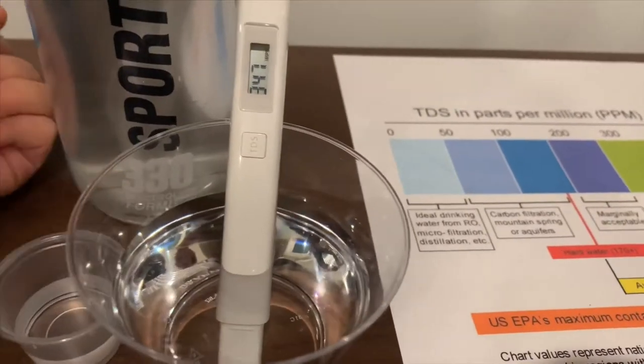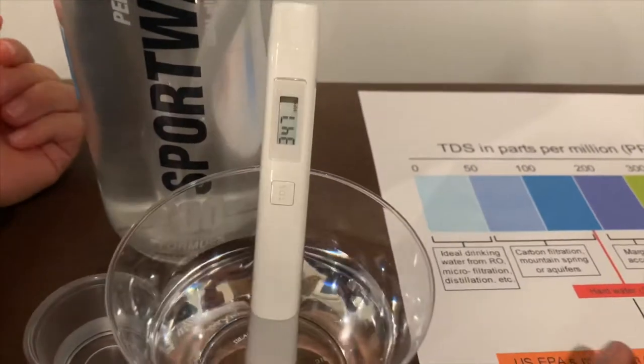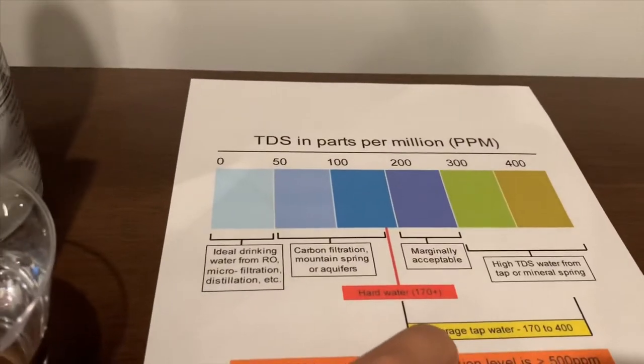147... 137... 347. That is average tap water.